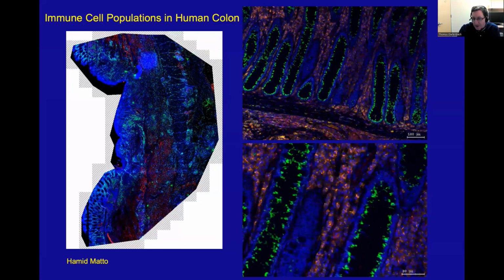And here's an image showing human colon. A lot of our tissue samples are biopsy samples from patients with AIDS. On the left, just an overall view of the stitched region, and then some close-up images. Usually we're imaging at 20x, and that is pretty good for resolving certainly single-cell detail, but even some subcellular detail, because our camera is 2048 by 2048 pixels, so it's a very good resolution camera.